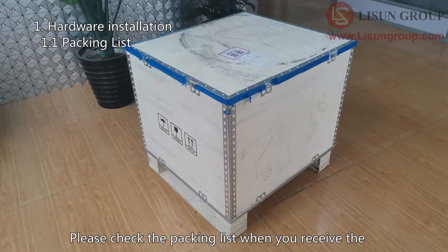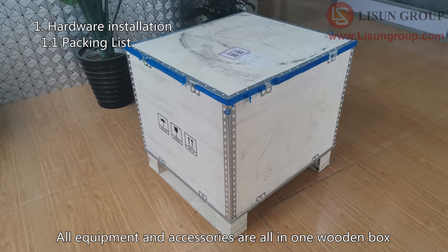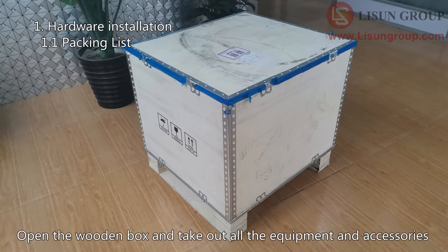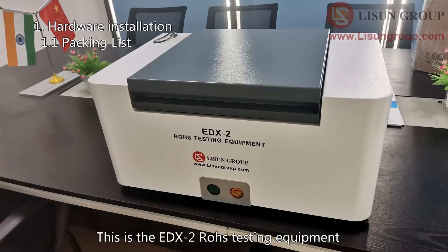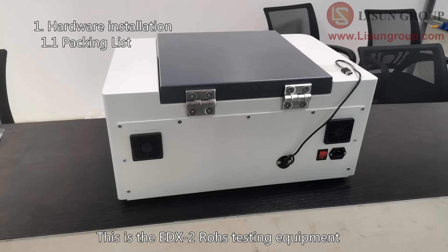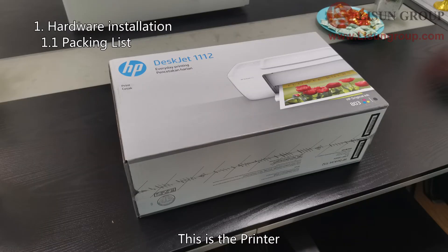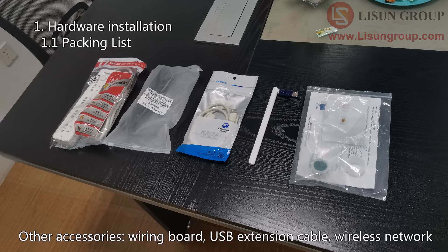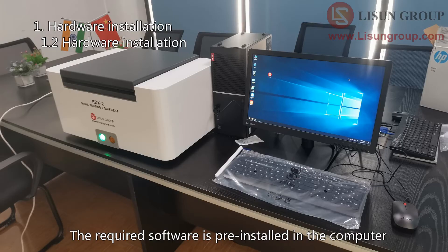Please check the packing list when you receive the EDX2 Rose test equipment. All equipment and accessories are in one wooden box. Open the wooden box and take out all the equipment and accessories. This is the EDX2 Rose testing equipment. These are computer related accessories. This is the printer. Other accessories include: wiring board, USB extension cable, wireless network, standard sample, small sample fixture, film, a slice of gold, etc. The required software is pre-installed in the computer.